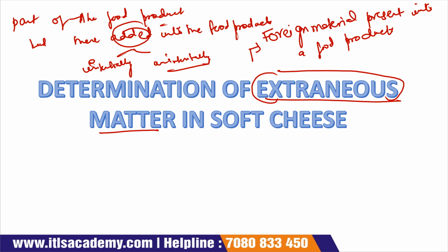Like suppose some bacteria are contaminated into the food product, then it will also come under the category of extraneous matter, okay.